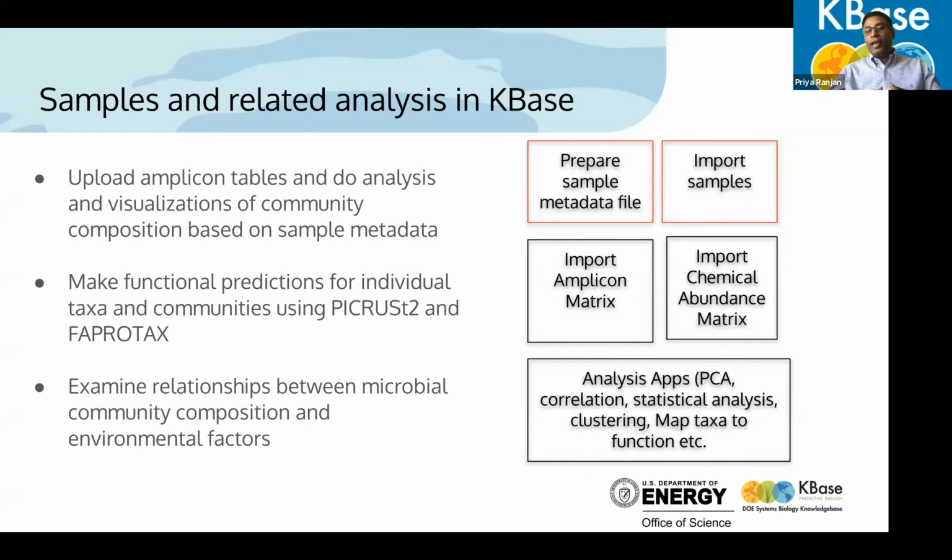And you may have similar analysis needs. If your data has similar features, you can imagine your data fits right in. But before you can do any of that, you have to prepare your sample metadata file or import the sample. So this webinar is to help guide you through that process and give you more details. By the end of it, you will have some idea about what samples are in KBase, how things are organized, and how things work.